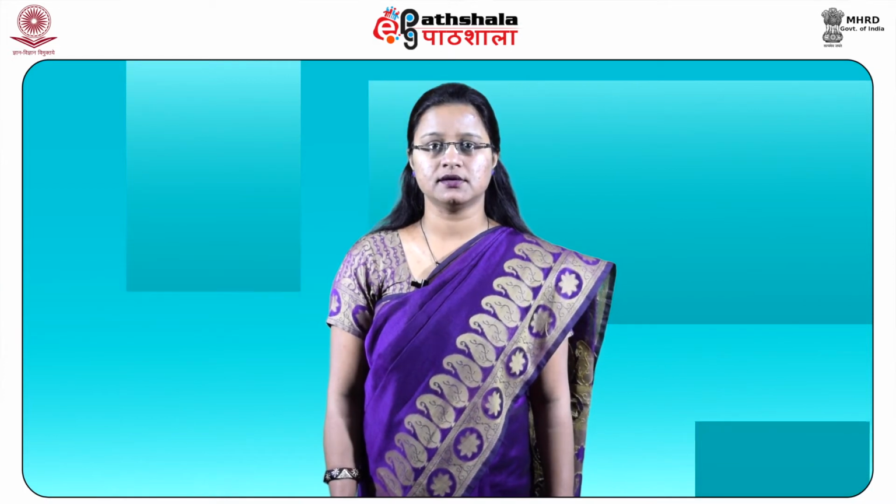Crude extract is then subjected to what is known as fractionation. Fractionation is basically a process that separates the proteins into different fractions, again based on their size, charge or solubility. We are going to first study the first and foremost fractionation procedure which is commonly followed. This is generally known as the salting out phenomenon. It utilizes the property of differences in solubility. Remember, the physical property being exploited here is the solubility.